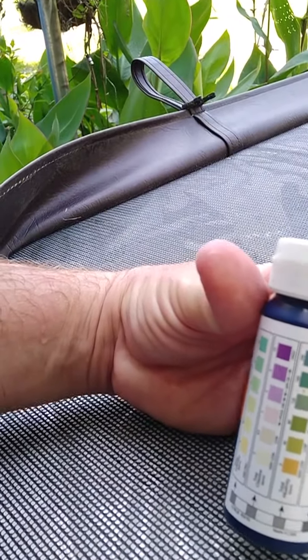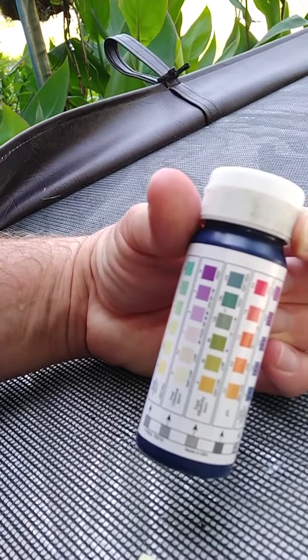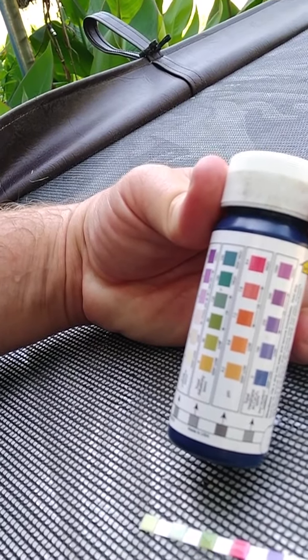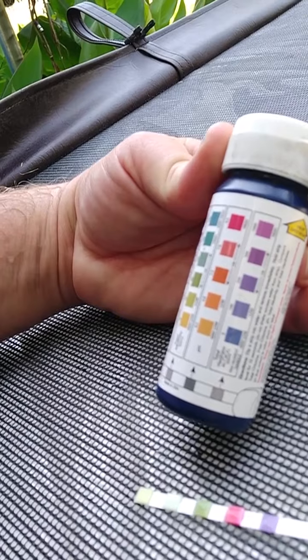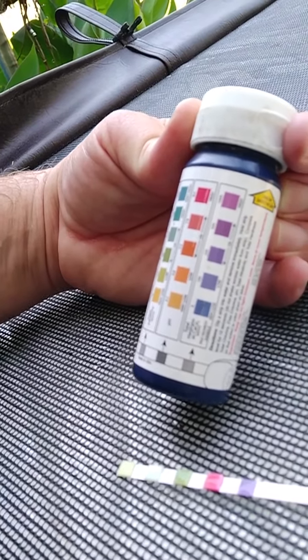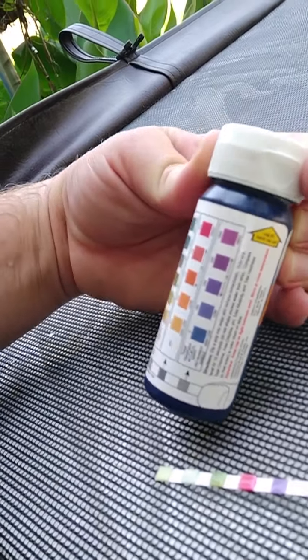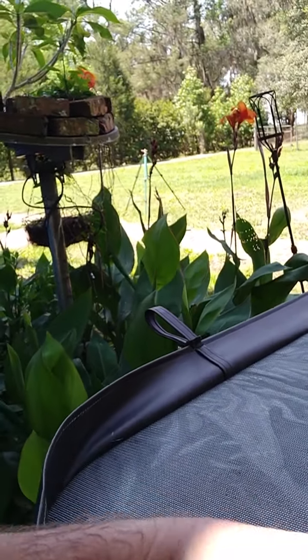by the color changes there, I need to add some chlorine. My total alkalinity is a bit low. My pH is high, so that needs to come down. And then my total hardness is a bit high, so I need to add something in to take down that hardness. Now, what in the world is pH?